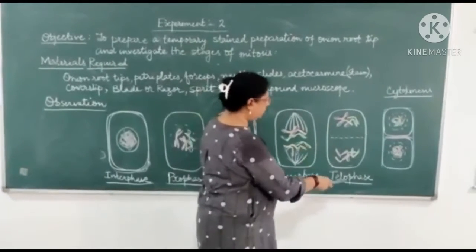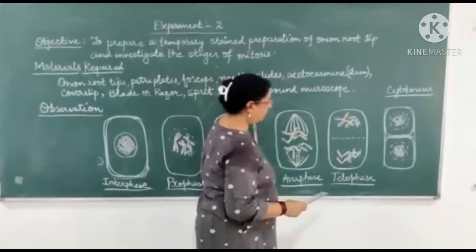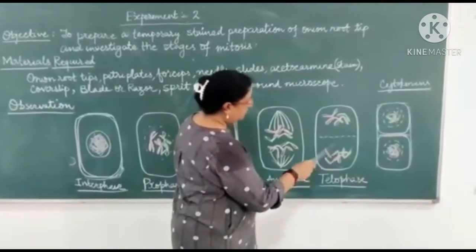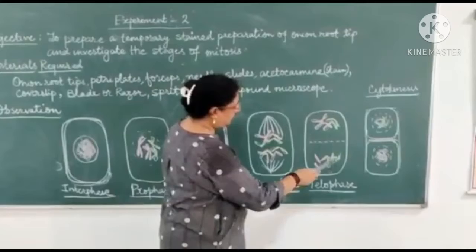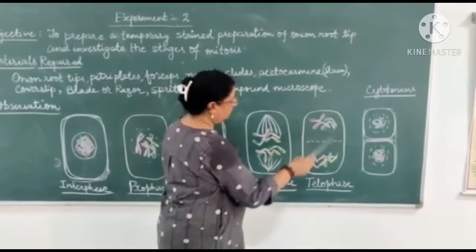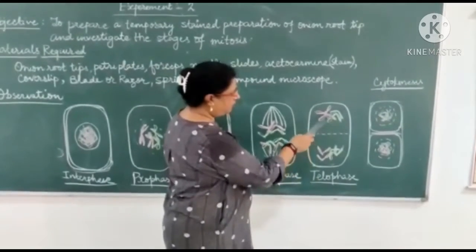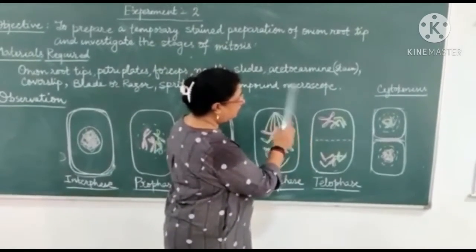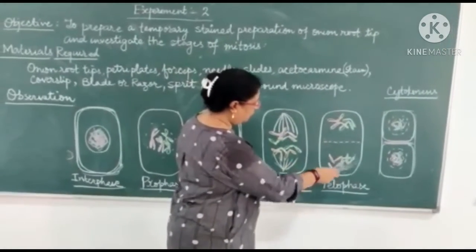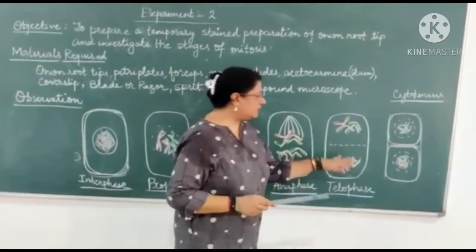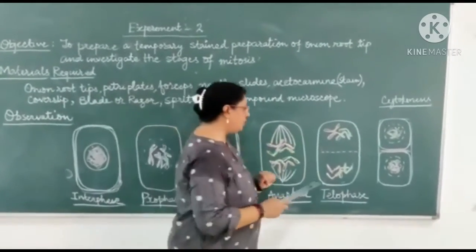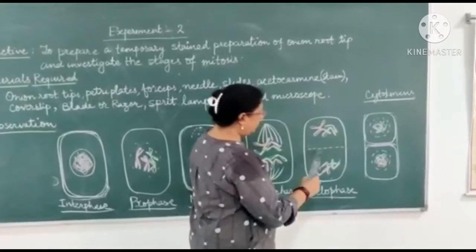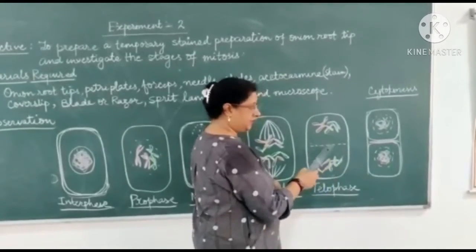In the next stage, that is telophase, which is the ending of the division phase. In this, the nuclear division completes by the chromosomes aligned to two different poles. You can see the chromosomes, four chromosomes have traveled to this pole and four chromosomes are in this pole. In this division, no change in the chromosome number occurs. This also characterizes with the formation of cell plate.